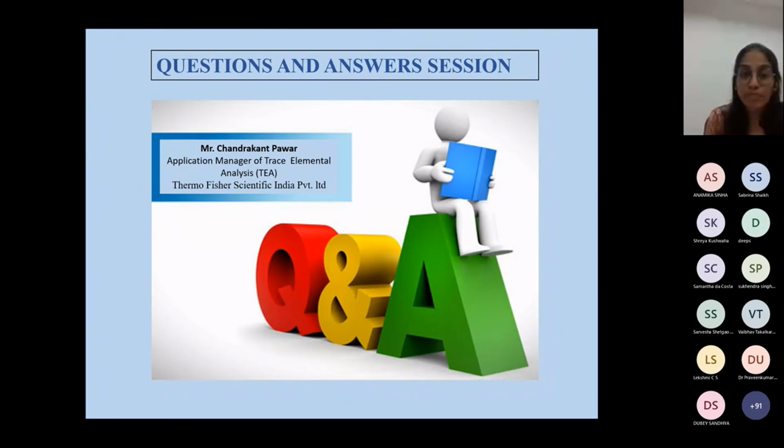It means it is in a tin container, or any round bottom flask, sticking to the crucible. Okay, in a tin crucible. Because what happens is that a tin crucible we have to use only one time. It is completely burnt, so it is not required. Only the reactor part.